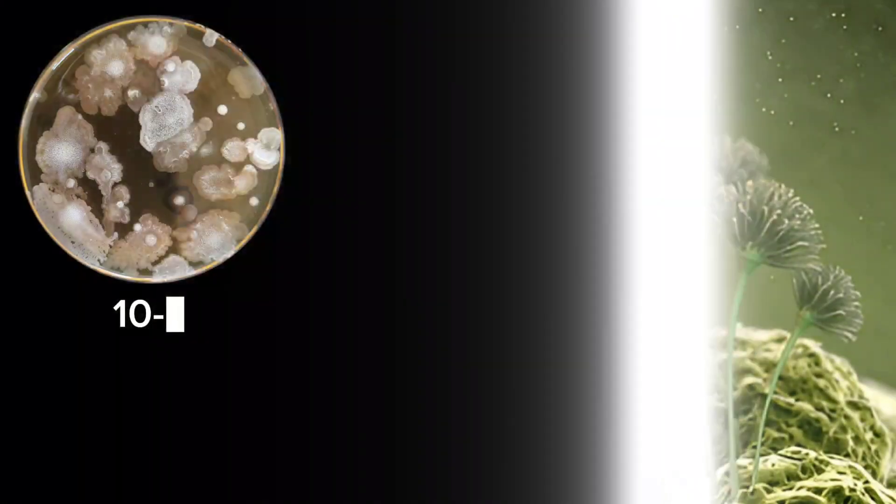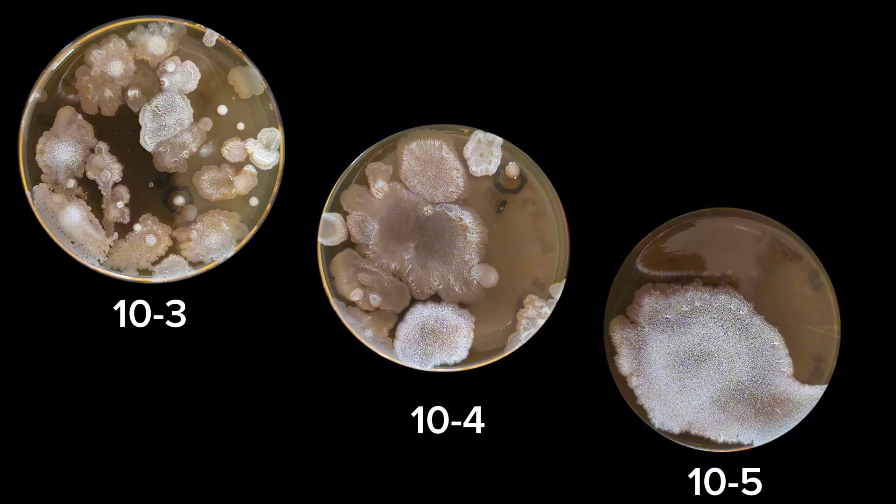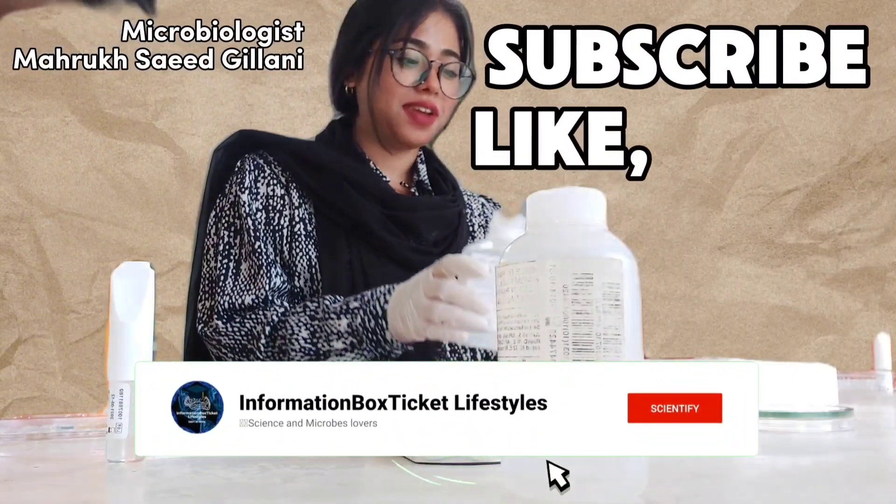Similarly, examine the fungal growth on Sabouraud dextrose agar.